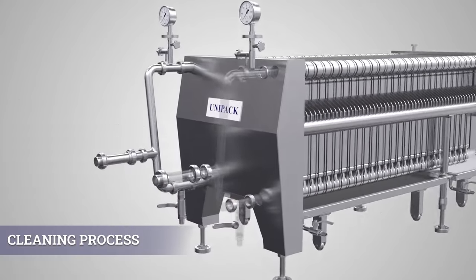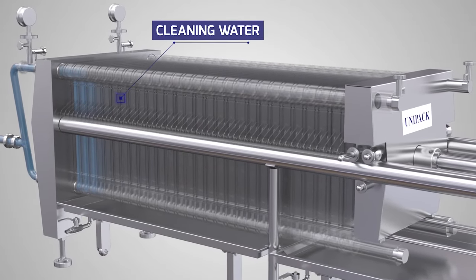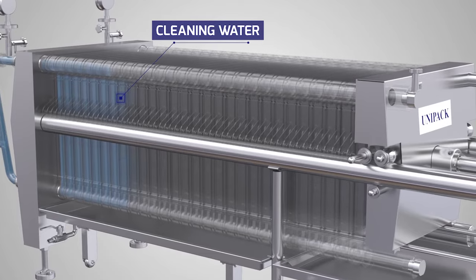In case of corrosive liquid filtration, like in pharmaceuticals, where rubber material compatibility issues may arise, the plates and frames can be offered without any sockets, avoiding the presence of rubber washers.